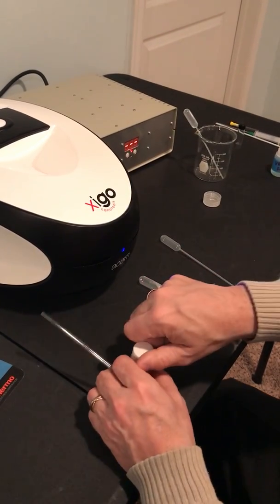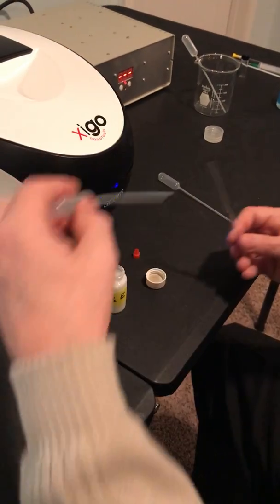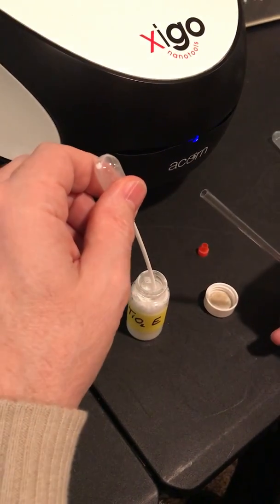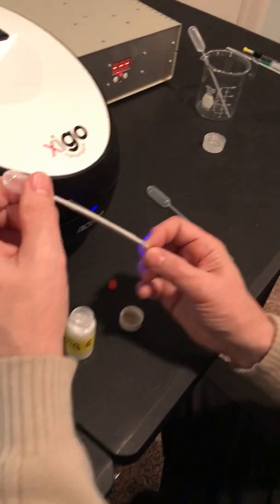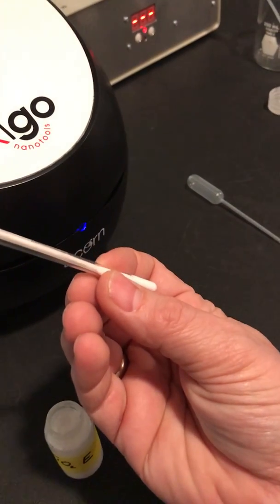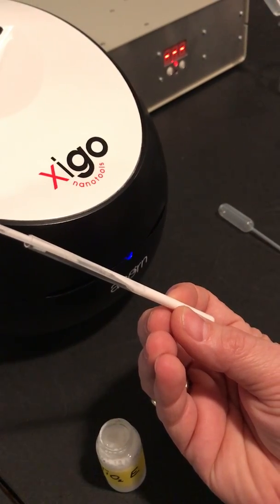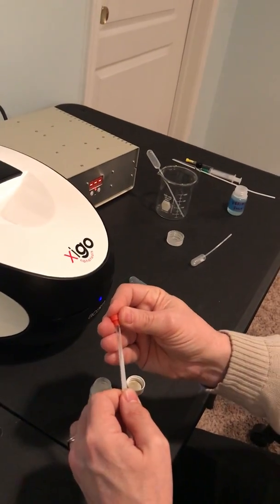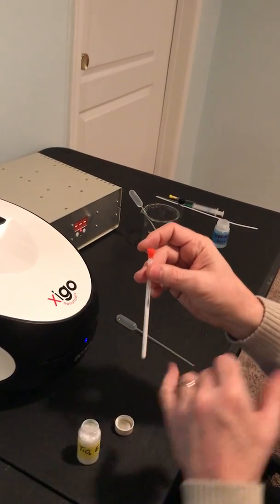So what I'm going to do here is open up the top. I'm going to take some sample here. All right. I'm going to insert it like that. Okay, now I'm good. So I'm going to put my tube on. I filled this tube up to a height of 54 millimeters. Okay, about that to there.